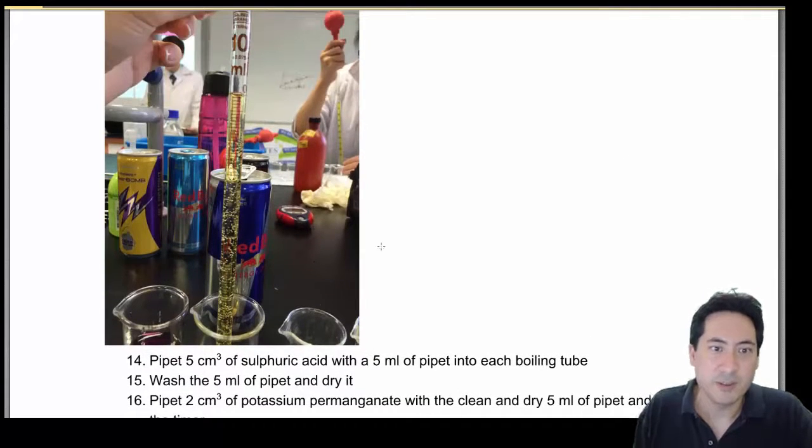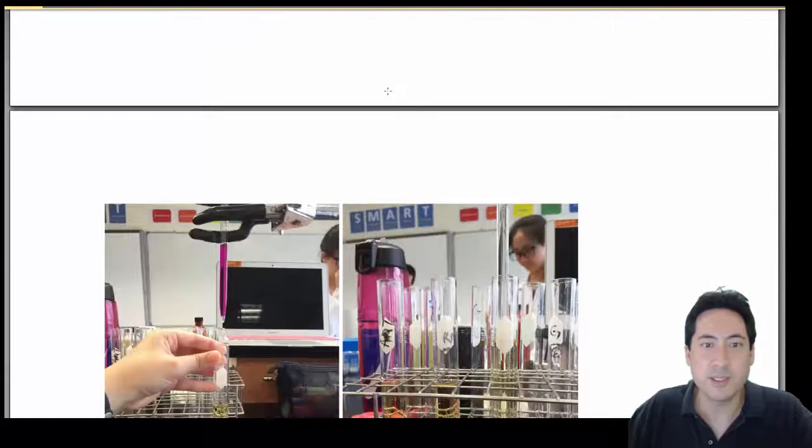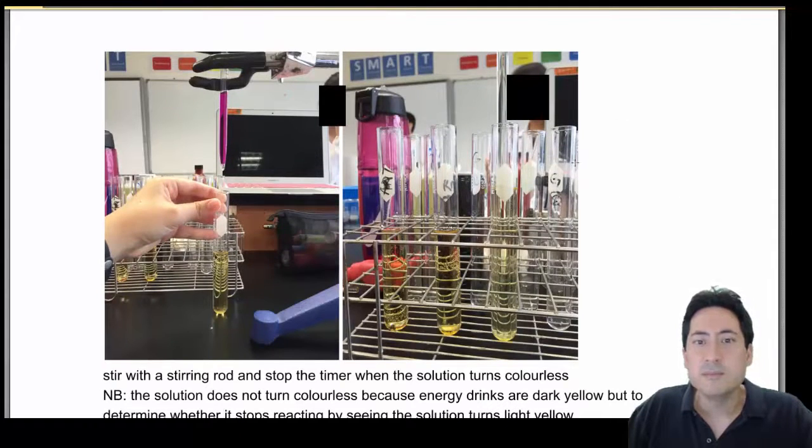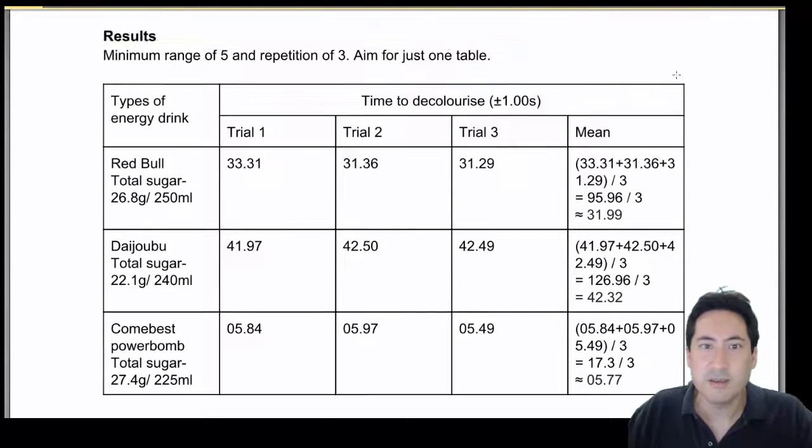See, I love these photos. What's all this bubbling stuff here? Alright, I hope you've put that in your qualitative observations underneath your quantitative and explained that. Alright, I just stopped the video then to put these black boxes in. So it's gone yellowish. Alright, I'll have to deal with that later. Alright, this is mainly to see if you finish your experiments. So let's have a look at these.